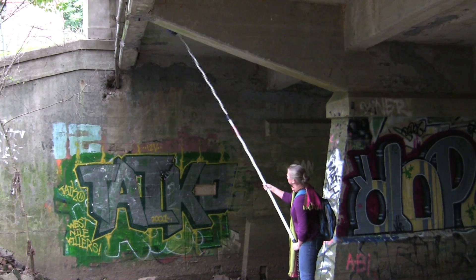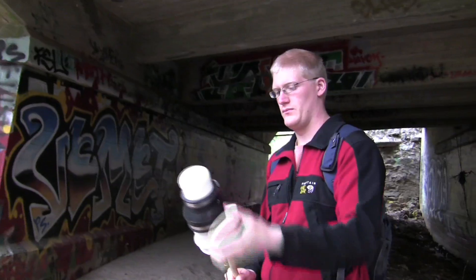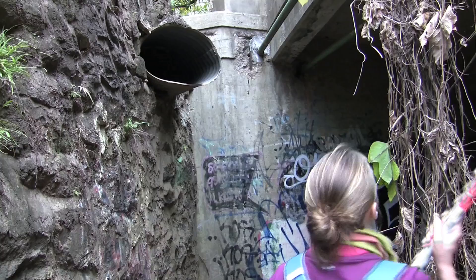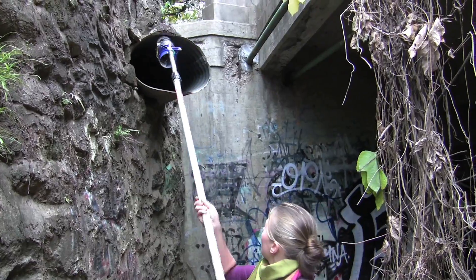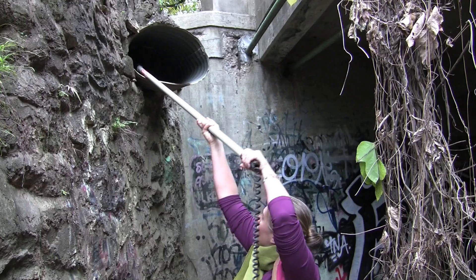We're talking about a price difference from the original $500 or $700 of the backpack aspirator to $50 for our new device. For us, developing a tool that can be easily accessible for people in developing countries is key. We are trying to provide enough information in our paper for other people to build their own aspirator, but also to have a company working on production of this device and selling it at a competitive and accessible price.